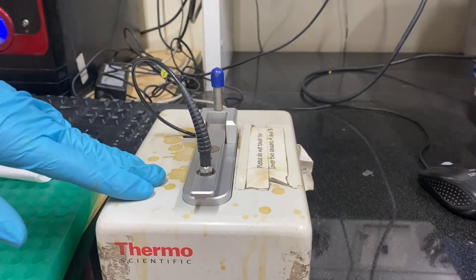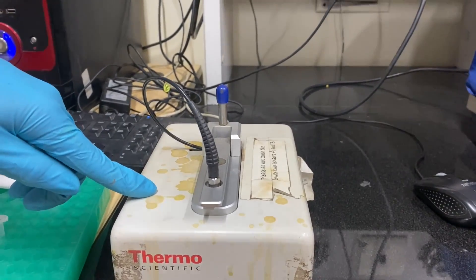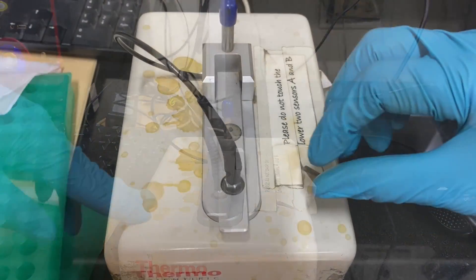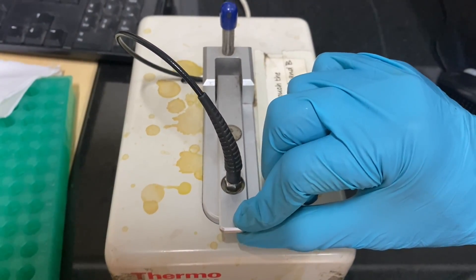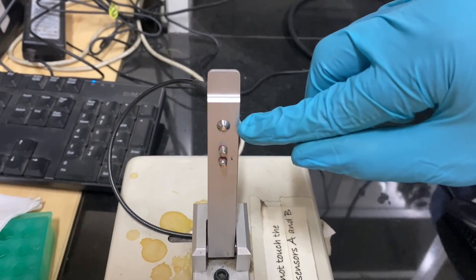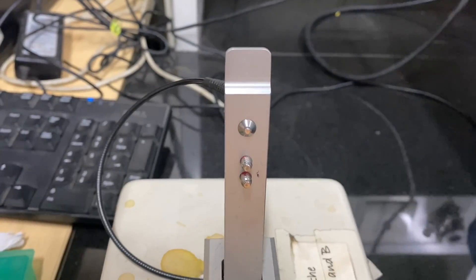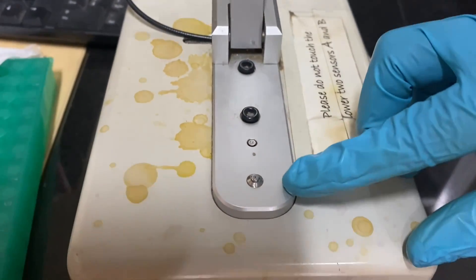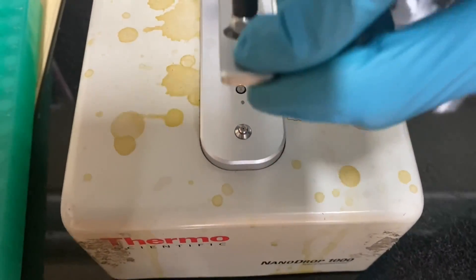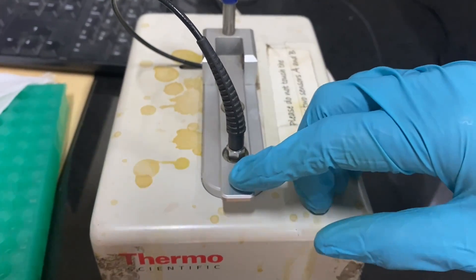This is a NanoDrop spectrophotometer from Thermo Scientific, which is connected to a CPU and accessed through the software — I will show you the software in a minute. This is the sampling arm. We have to load the sample onto the pedestal, snap the sampling arm down very gently, and then we can take the readings.